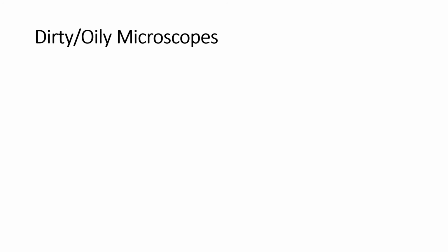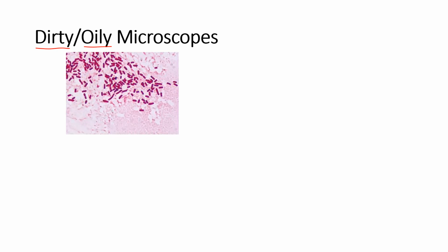The most common problem with microscopes is having dirty, and when I mean dirty, I mean oily microscopes. This is an incredibly common problem. And it's because we are using oil immersion and we have many students using all the microscopes and they are not cleaning them appropriately.